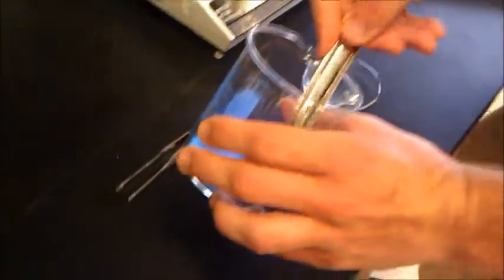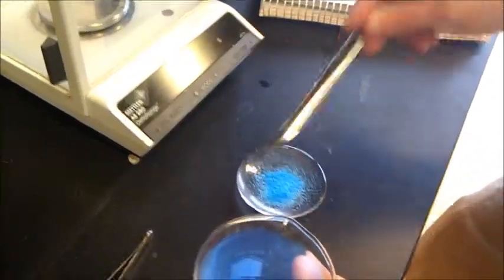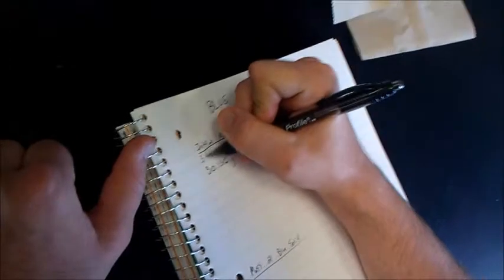After recording the mass of the watch glass, the solid is then added to the watch glass. The watch glass is then put back onto the balance, closing the doors to minimize air movement due to air pressure. And finally, by subtracting the initial mass of the watch glass from the combined mass of both the watch glass and the solid, the mass of the blue solid is obtained.